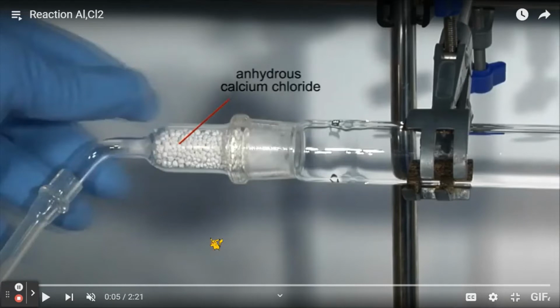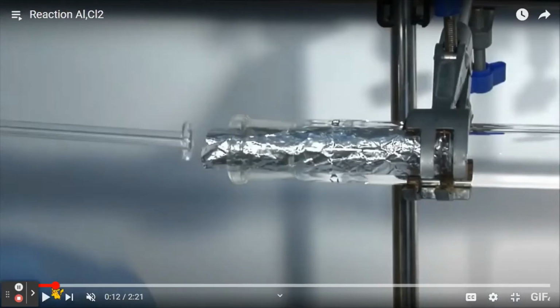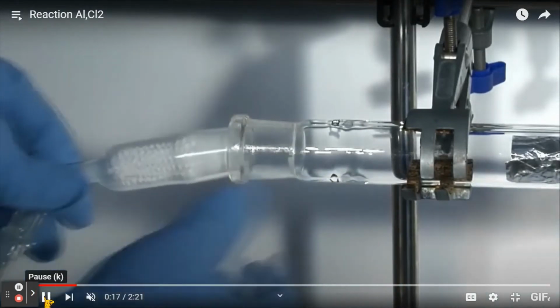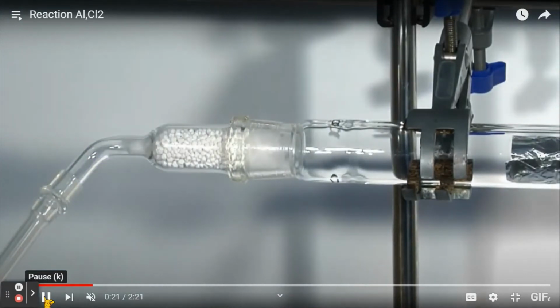You've set up your apparatus. Air is being drawn through from right to left because you've got some sort of suction pump that is drawing it through. And now this person is actually ready to start the experiment. So there you go. There's the aluminium that goes in there. Okay, they're just temporarily replacing it with that, and now this is going to be connected to the chlorine source.